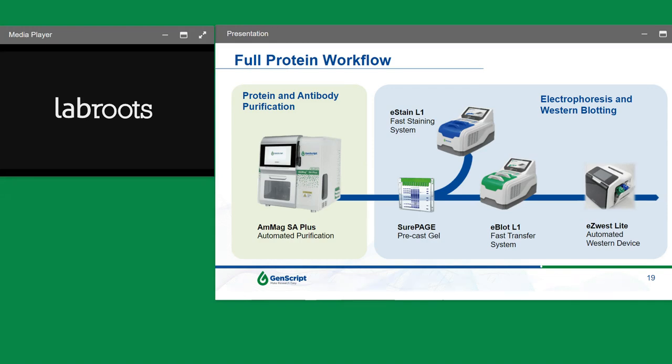We have a full protein workflow. To the left-hand side is what we call our AmMag SA Plus, which is a completely simple, semi-automated, and very affordable purification setup for protein or antibody purification in a 12-sample setup in about an hour. We also have electrophoresis and Western blotting solutions, including precast SurePAGE gels with loading capacity exceeding many industry products due to their well shape. We also have a wet staining system called the e-Stain, an e-Blot for transfer, and an automated Western device.